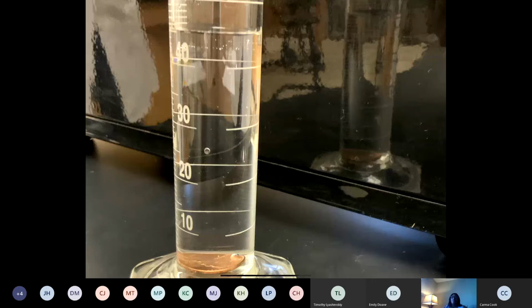Okay, we are back in the general meeting room. I'm just going to run through the pictures and videos that you should have viewed for inquiry set 3. This is the volume of 1 penny, the final volume in the cylinder after adding 1 penny. Let me clarify that. I estimate this to be 45.2.